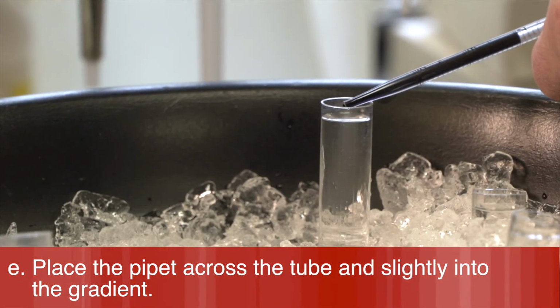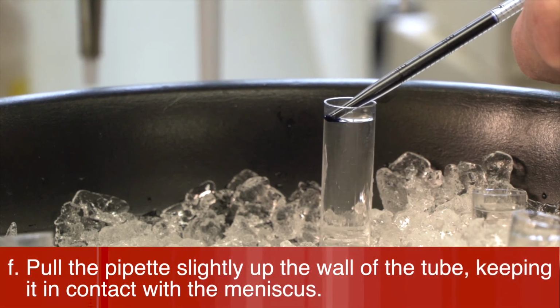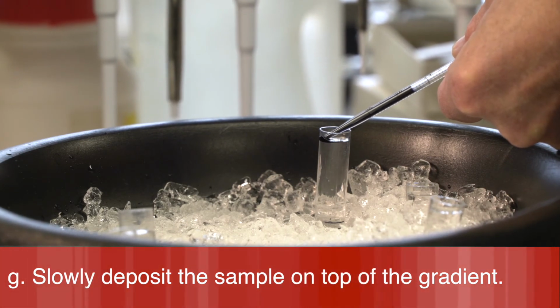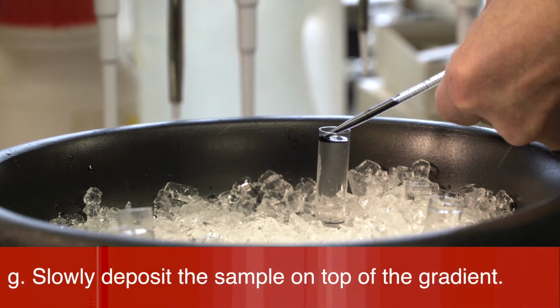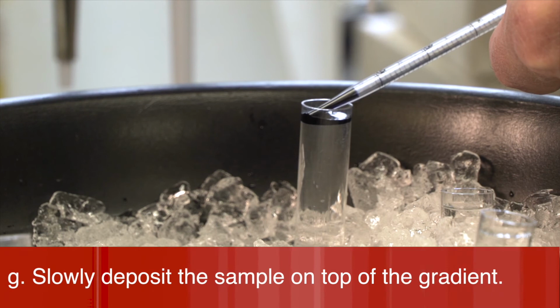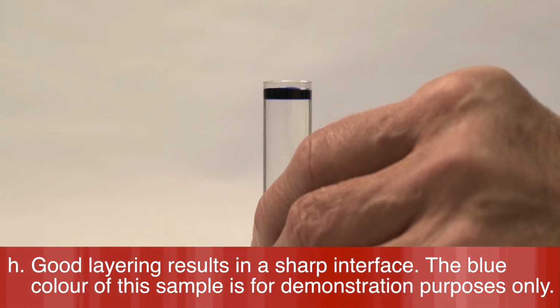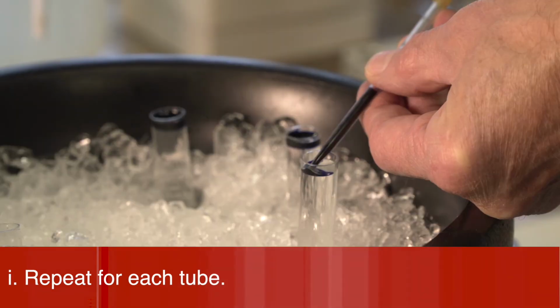Place the pipette across the tube and slightly into the gradient. Pull the pipette slightly up the wall of the tube, keeping it in contact with the meniscus. Slowly deposit the sample on top of the gradient. Good layering results in a sharp interface. The blue color of the sample in this video is for demonstration purposes only. Repeat for each tube.